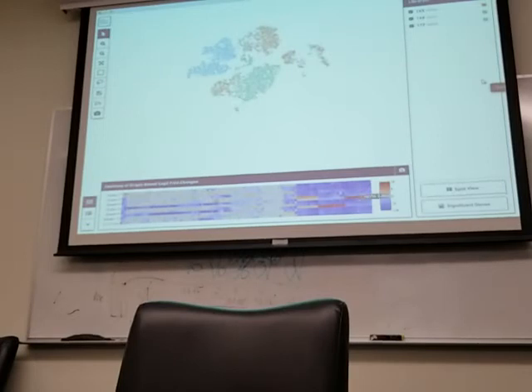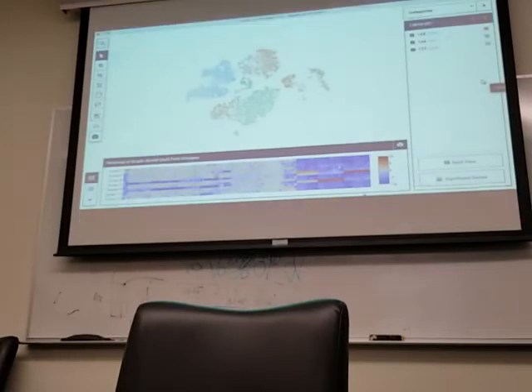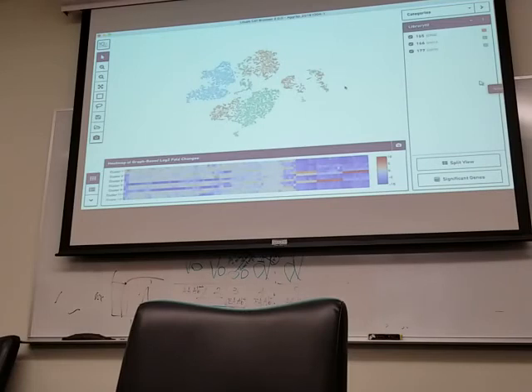And if we take those B cells with that signature and select them, maybe there's 500, and look, is there any clonality by any way in those versus the ones that don't have that signature? Is there a difference?